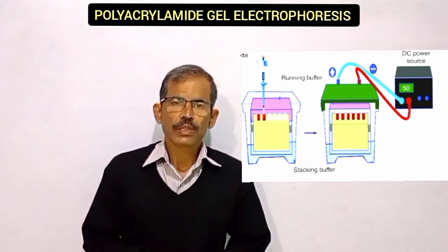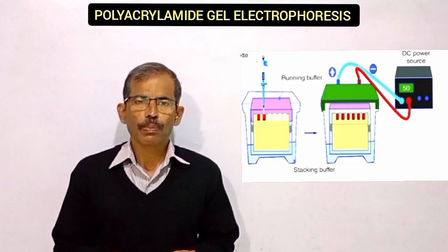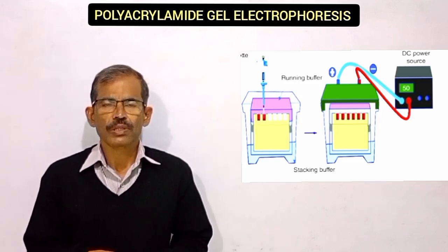Today we shall discuss the principles, procedures and the applications of polyacrylamide gel electrophoresis.